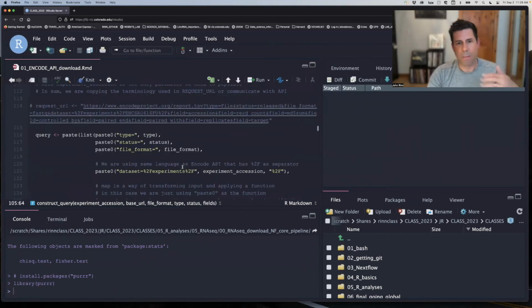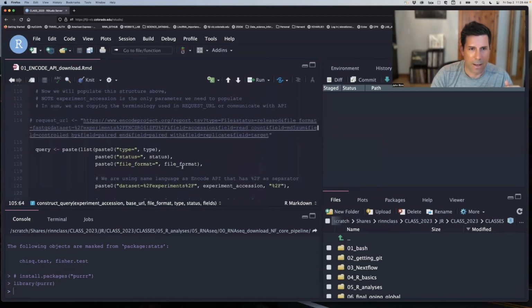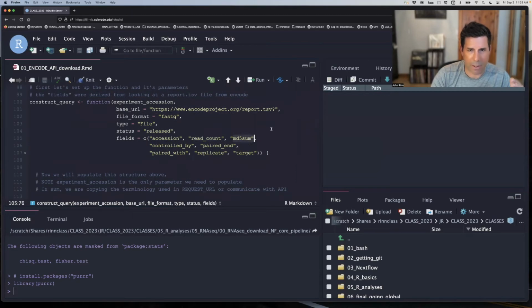So we're just making the same format for the URL where we can modify it to get MD5 sums for one. So we did have to experiment with this to get that. Was it MD5?